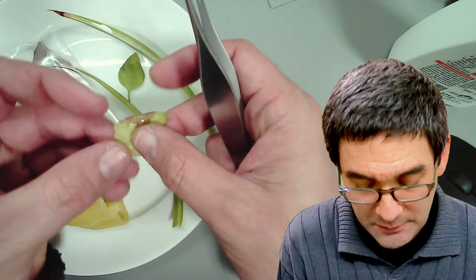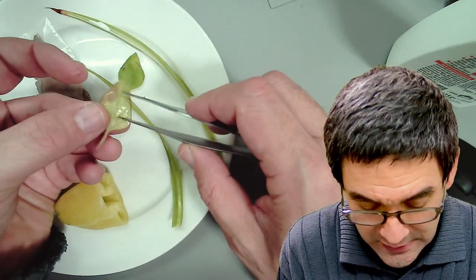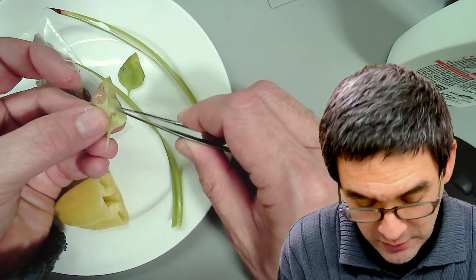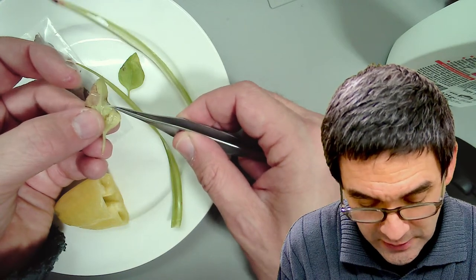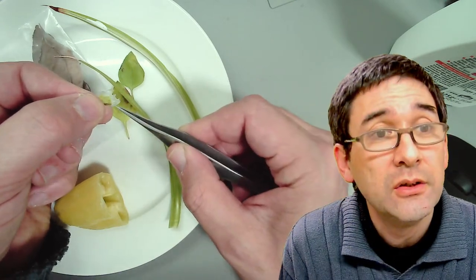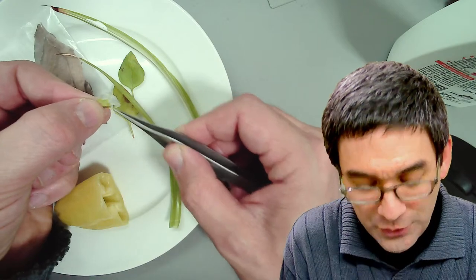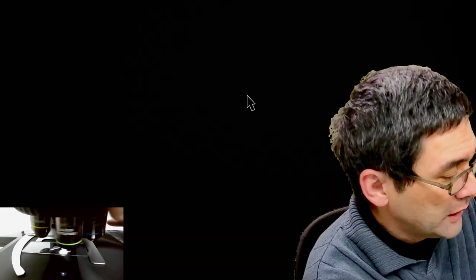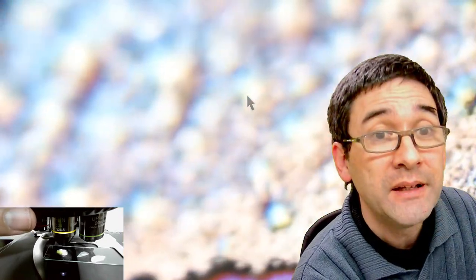What I would like to do now is show you the last one over here — I also put some glue on here, a little bit more difficult to peel off. There's still some leaf connected here — I'm just going to leave the leaf on here and put the whole thing under the microscope simply to have a look. Let's go down with low magnification. And here we go — you're able to see the cells again. The surface has a different shape here for this different plant.